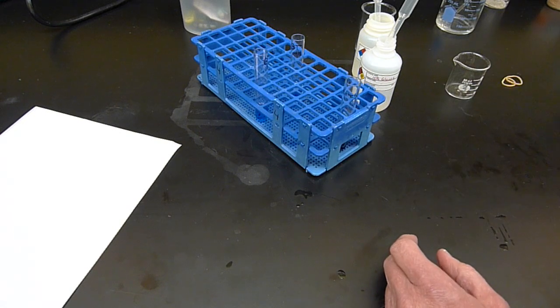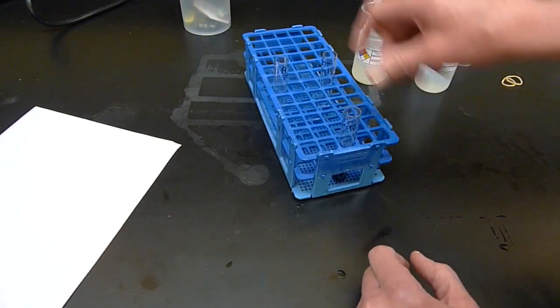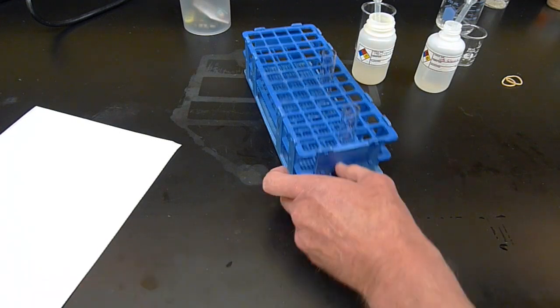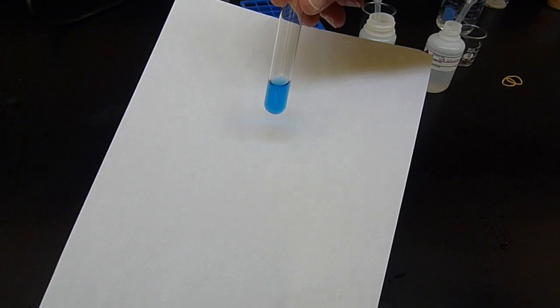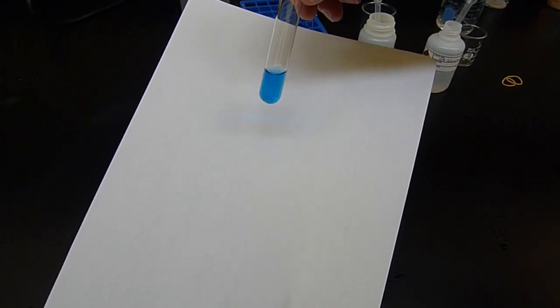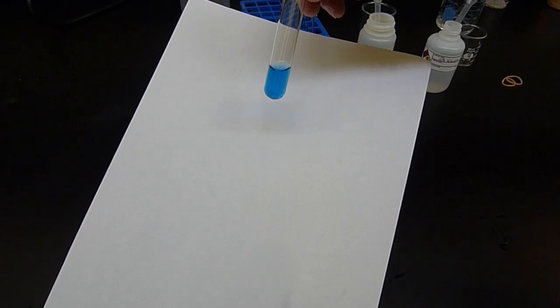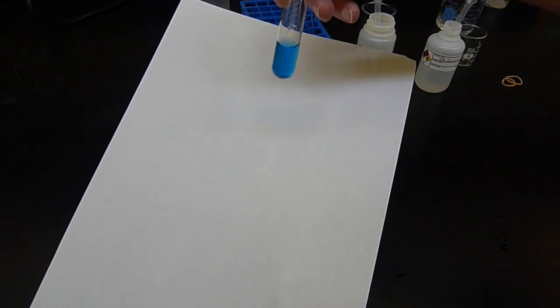The other test, which I won't demonstrate immediately, is for glucose, and this is Benedict's solution. Benedict's solution is this light blue solution here. You put something in there that you suspect has some sugar in it. You boil it because it has to be heated so the reaction occurs, and you get different shades of color. It starts out as this light blue.